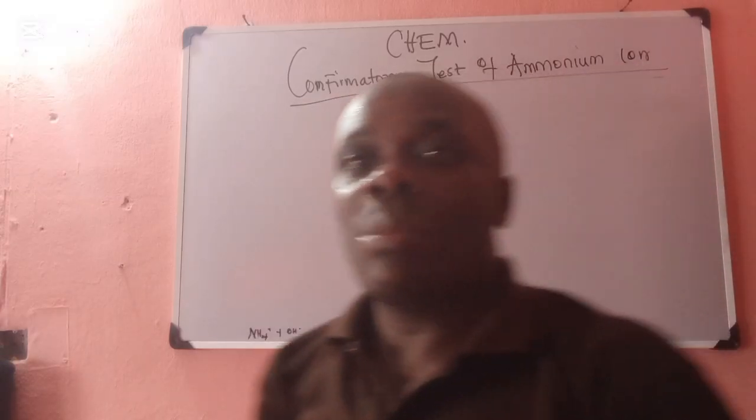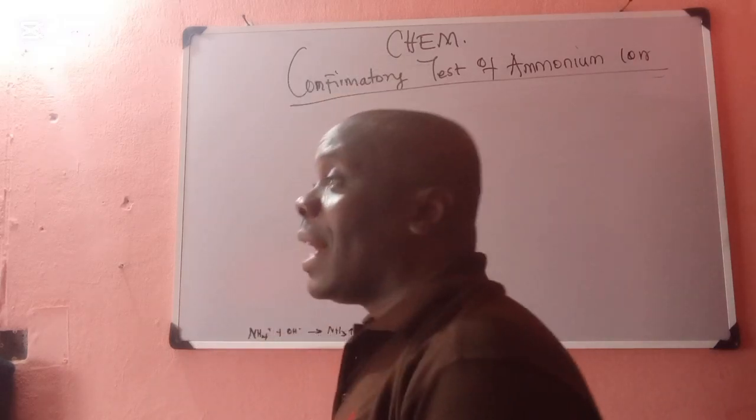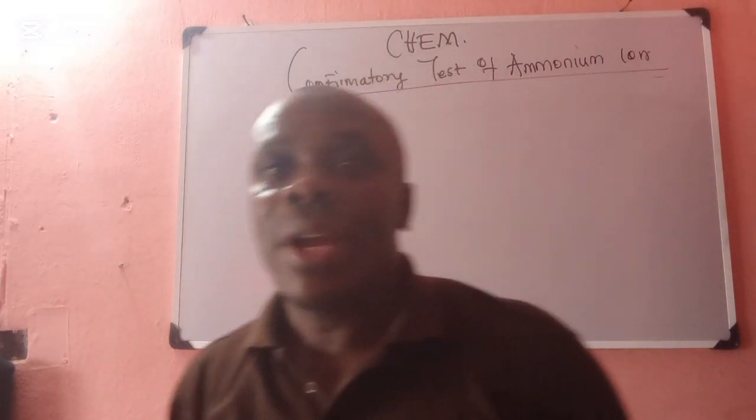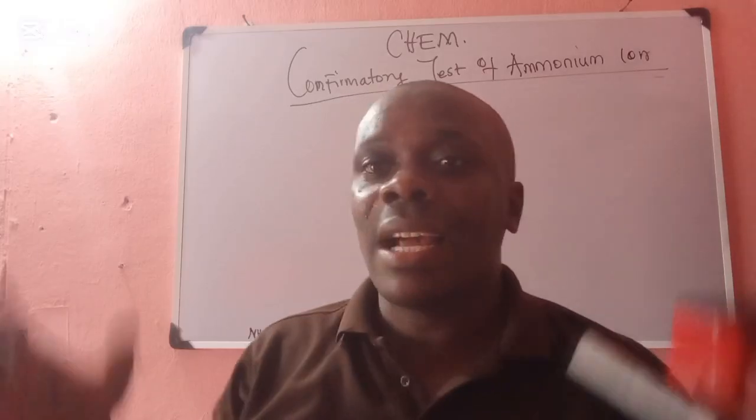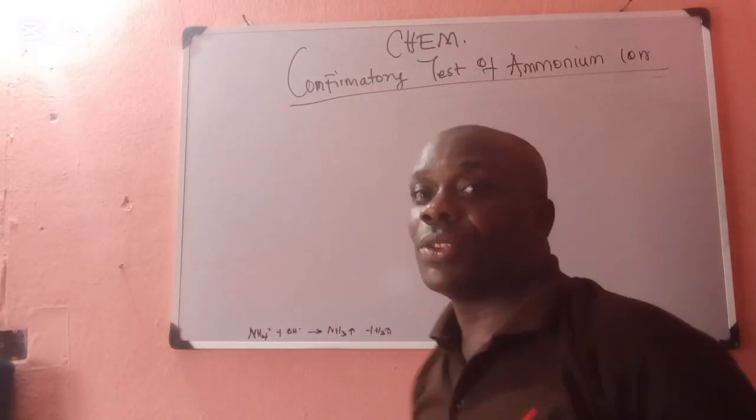So on this note, we are going to look at some of the things involved when trying to test the presence of ammonium ions.